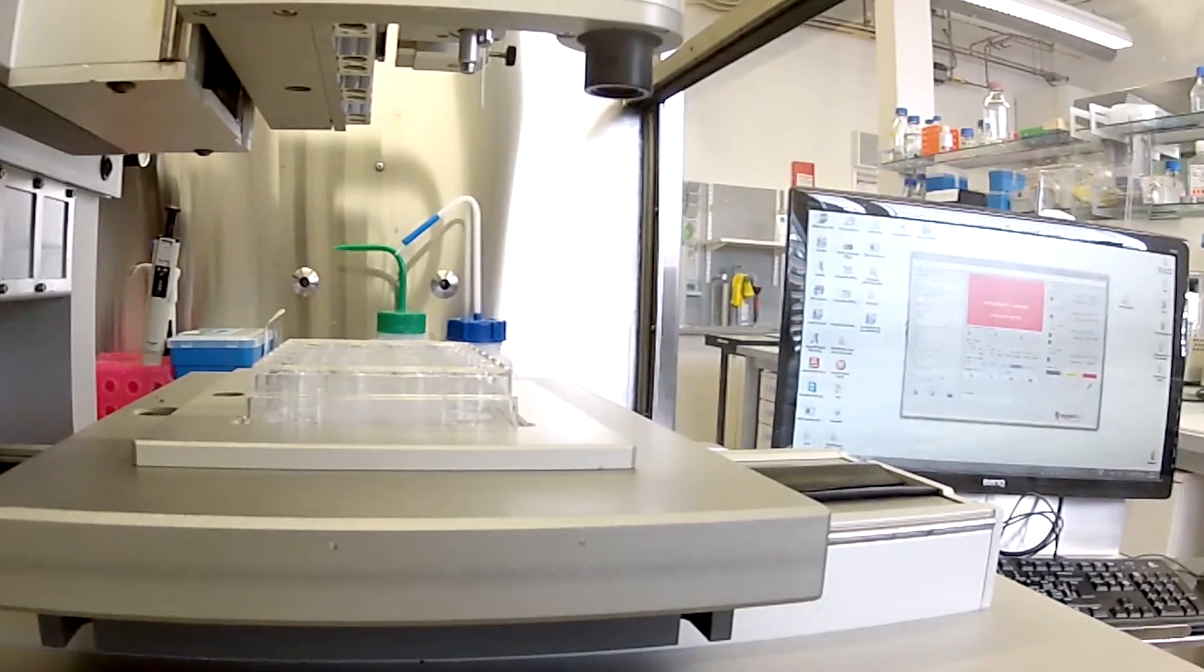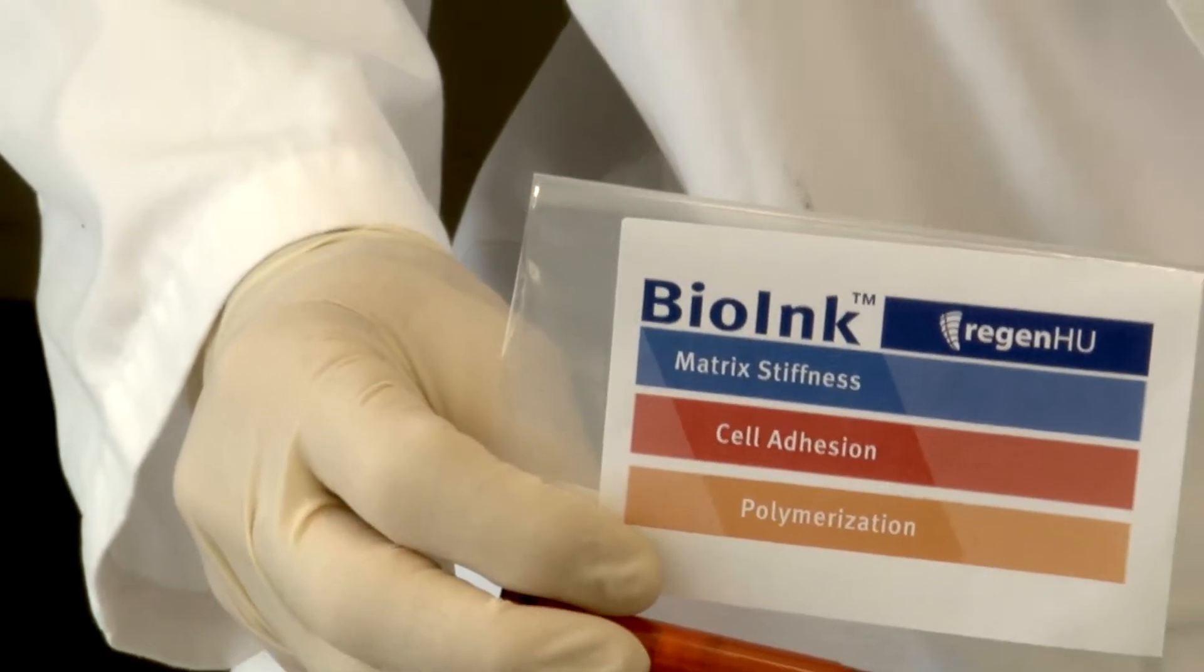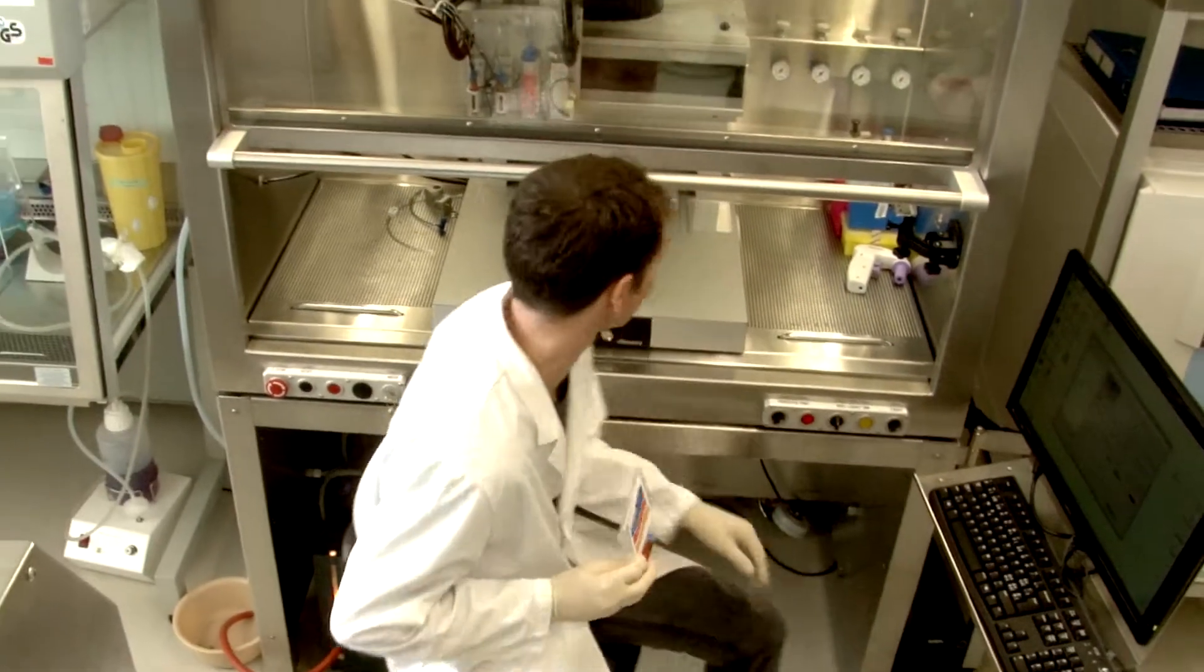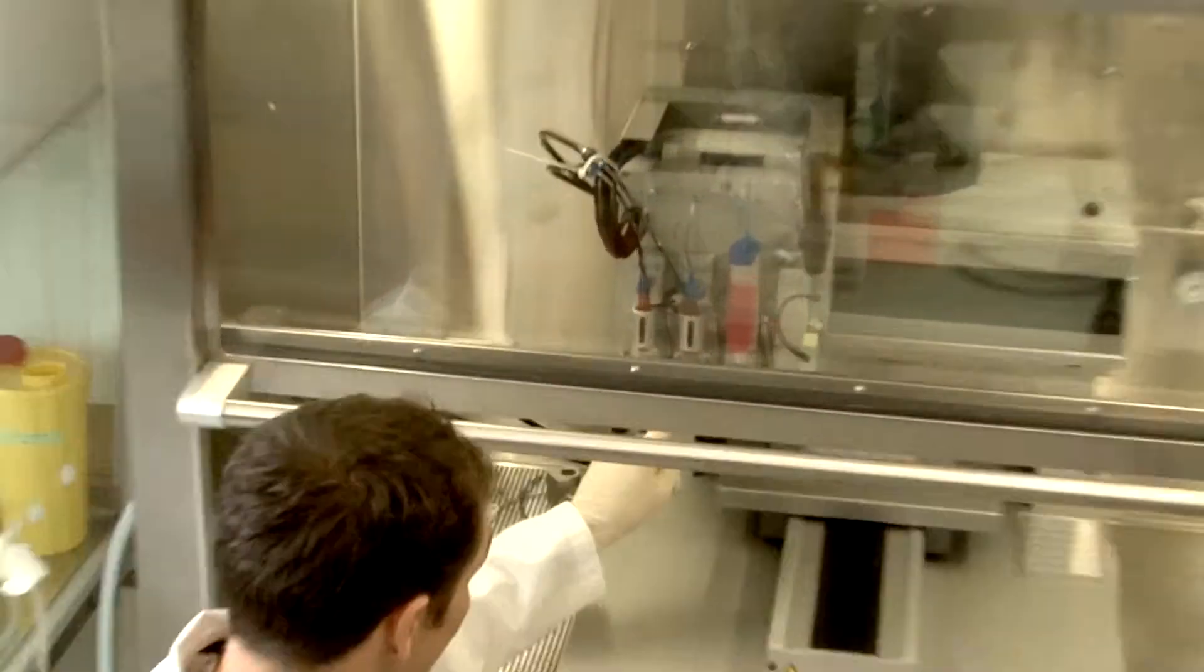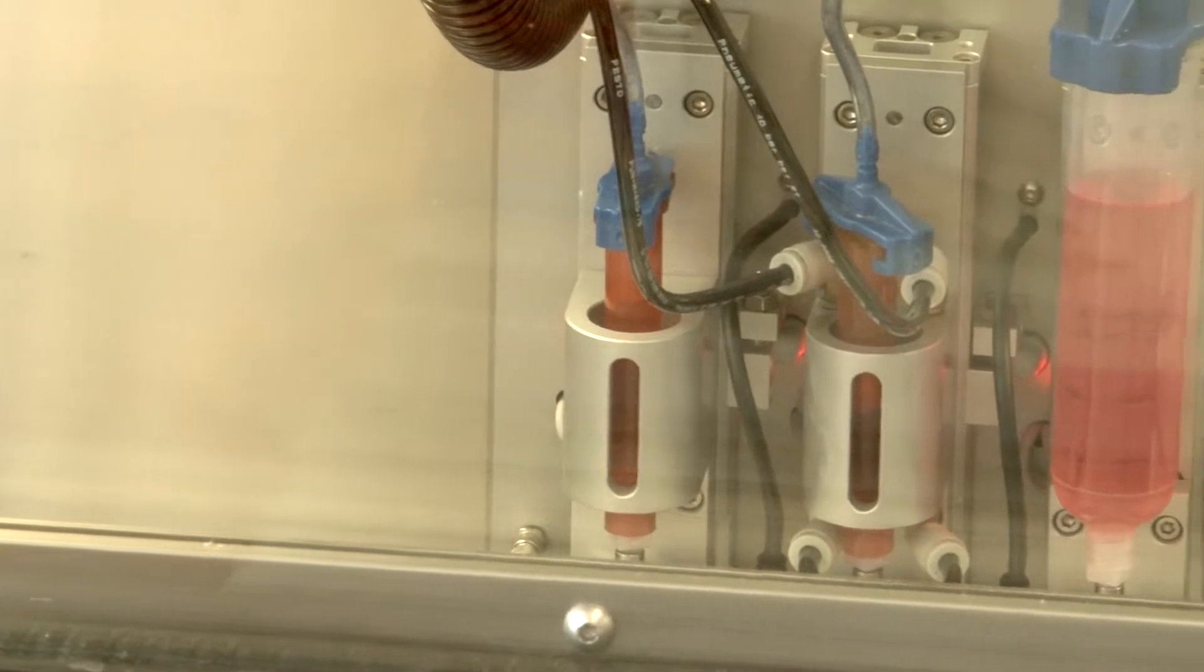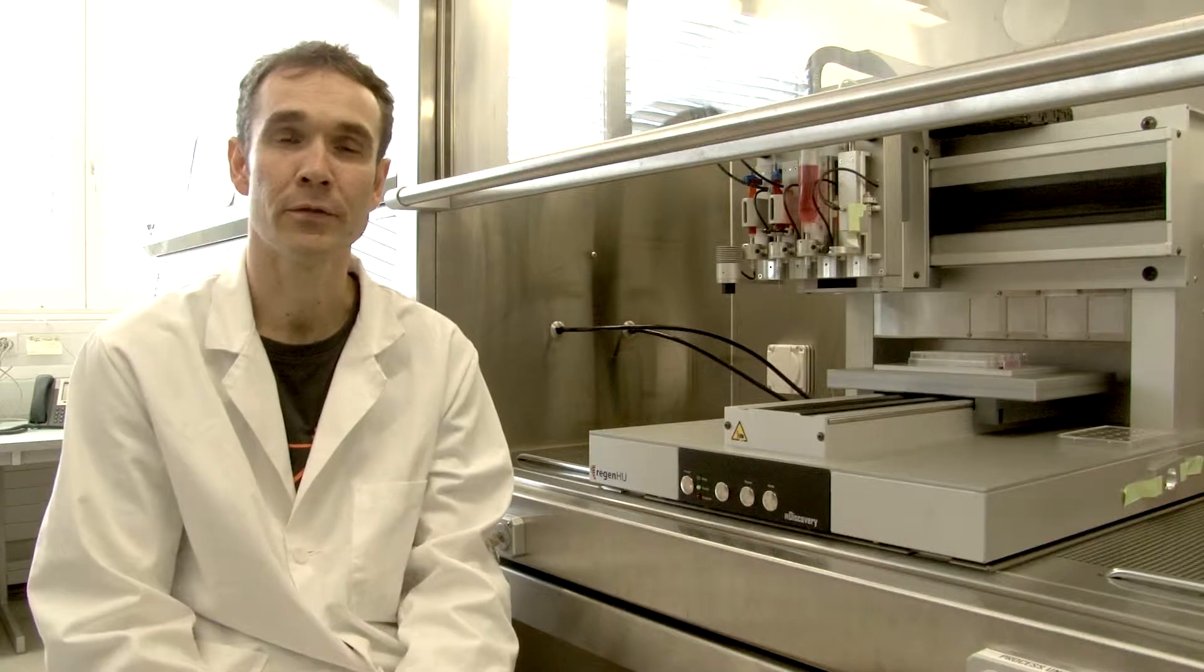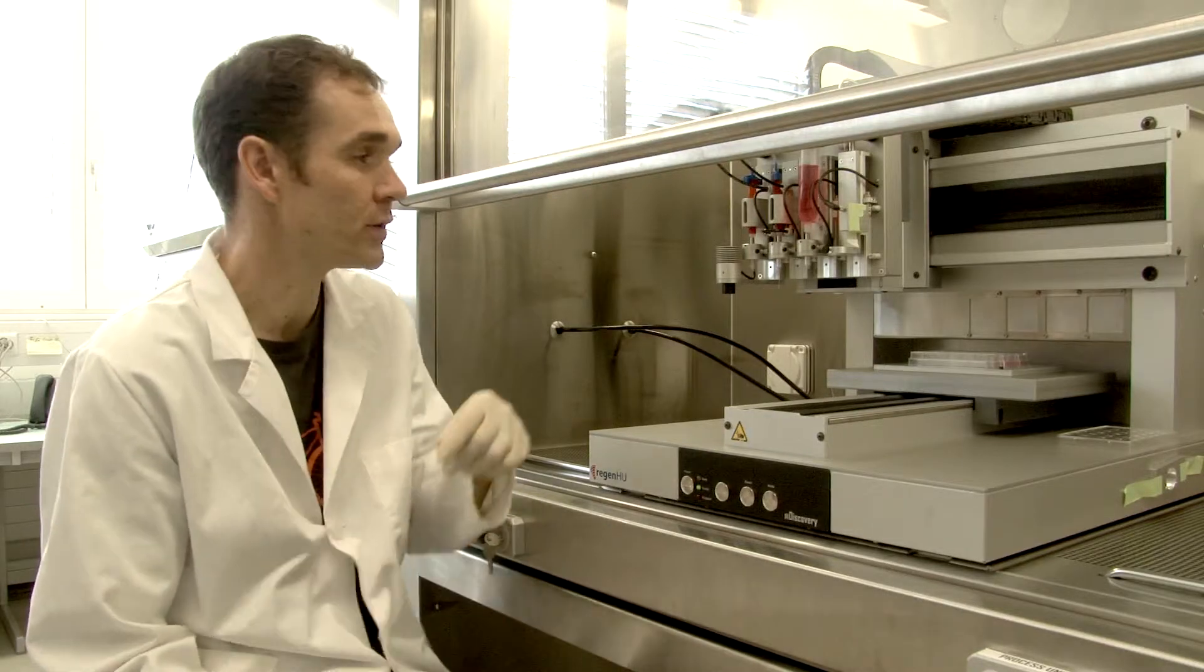We developed an extracellular matrix-like hydrogel called bioink in which the cells can proliferate and migrate. The bioink is solidified with the photopolymerization unit using visible light.